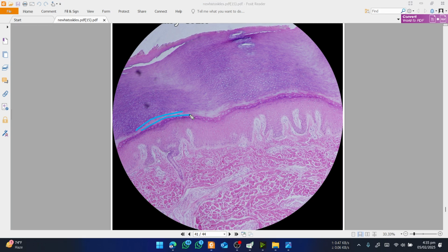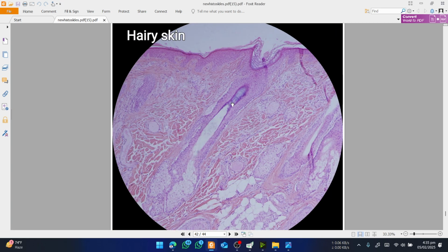This is the layer that is non-stained, that is stratum basale at the bottom. Then there is stratum spinosum, then stratum granulosum. This part is called lucidum, the clear layer, and that is the stratum corneum. So this particular part gives away that it is present only in thick skin. So you can give the answer of thick skin, and you can give the answer of non-hairy skin too.